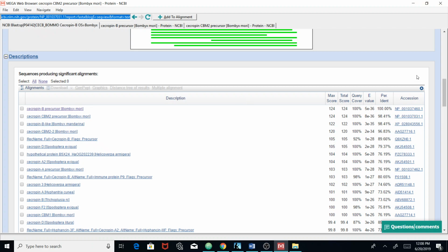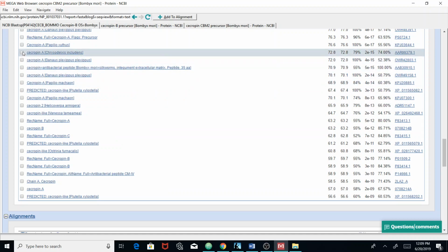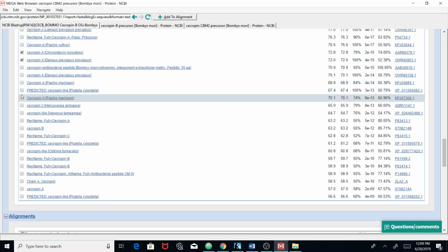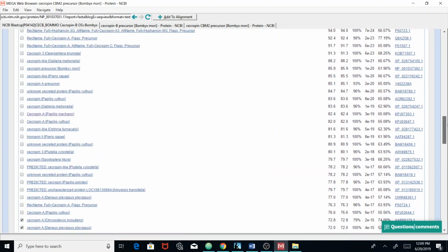Now, if you think this is too tedious for you, there's another route. If I'm interested in the first two sequences, and then I want to click some other sequences that have lower identity scores, and then a 50, I'm just clicking sequences. Now, your homework or the test might ask for sequences that have e-values in a certain range or identity scores in a certain range, and that would be your criteria for which sequences you need to choose.